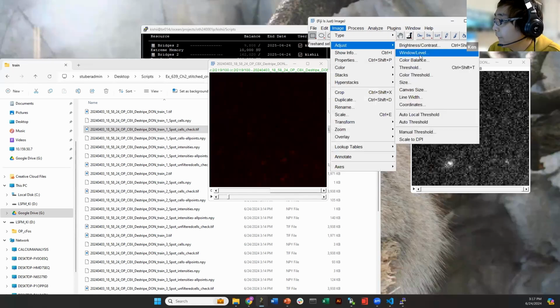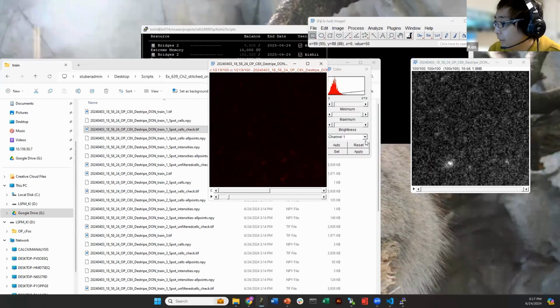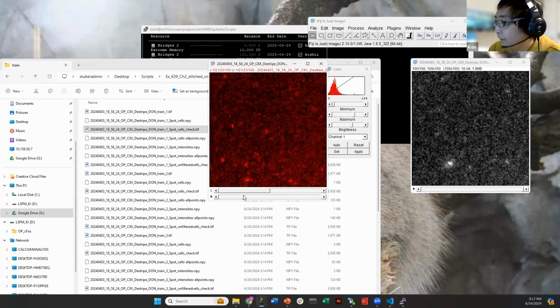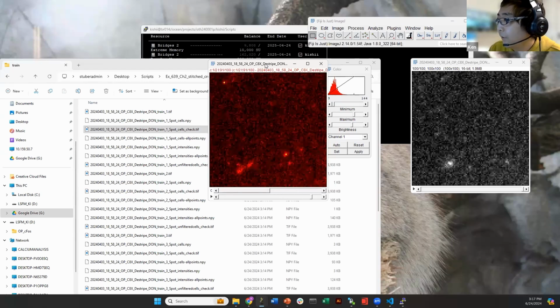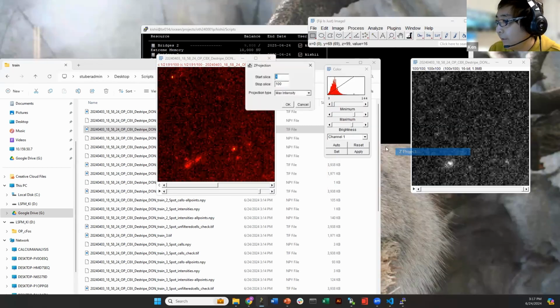The green channel listed here will show you the spots where the algorithm detected the cell. If you adjust the threshold or color balance a bit, if you adjust it to red, you can start to see the green dots appearing on top of the cells that you think there should be. Okay. You can also make something like a Z project.